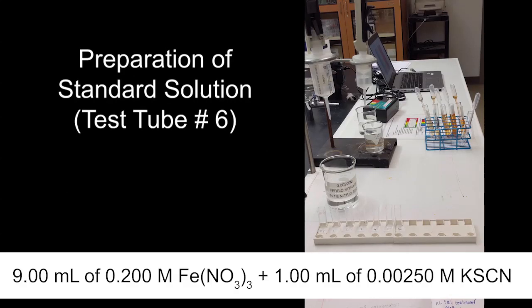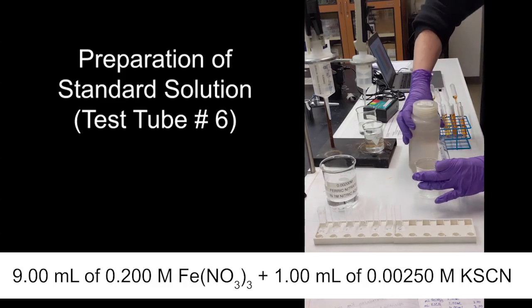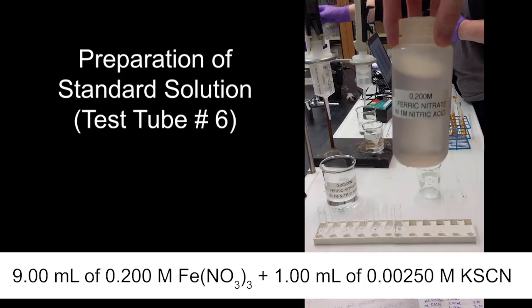Okay, now test tube number 6 is a little different. For test tube number 6, we are going to use a large excess of the iron, so I have to change the concentration. So I want to be really careful when I make up number 6. The instructions for number 6: 9 of the 0.2 molar iron. So I have a different concentration there.